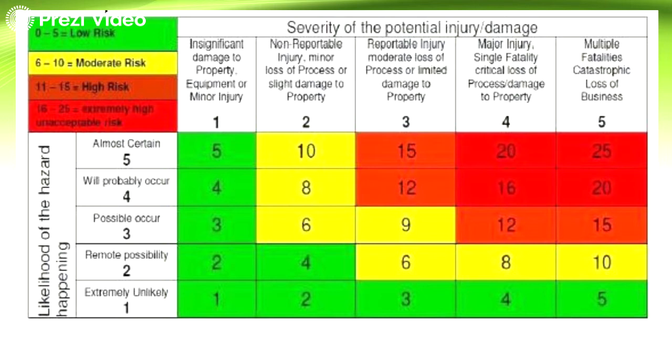Diba? So, for example, meron kang isang hazard dito. Kunyari, this hazard is about getting infection from Mycobacterium tuberculosis. Diba? So, ano ba yung likelihood na makakaroon ka ng damage to property by being exposed to that? So, for example, ang likelihood mo is 5. Diba? Lalagyan mo ito 5. Okay? So, ito example lang to on how they are grading the risk.